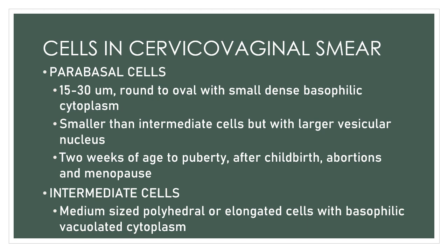Then you have your intermediate cells, and they are medium-sized, polyhedral or elongated cells with basophilic vacuolated cytoplasm. And so that is for your intermediate cells.